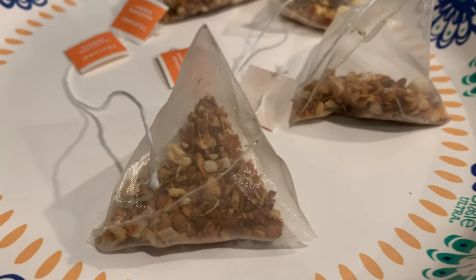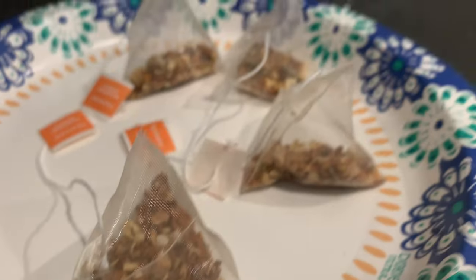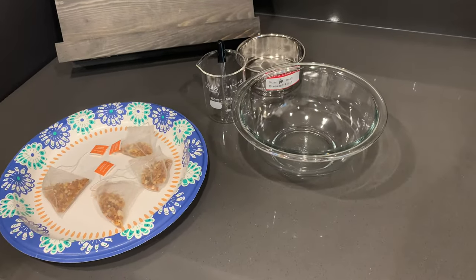Hey everybody, welcome to Fantastic Microbes and Where to Find Them, where we explore the microscopic world. Today we are potentially starting a new series that I'd like to call Microplastic Mondays, where we look at different things under the microscope to see if there's microplastics in them.